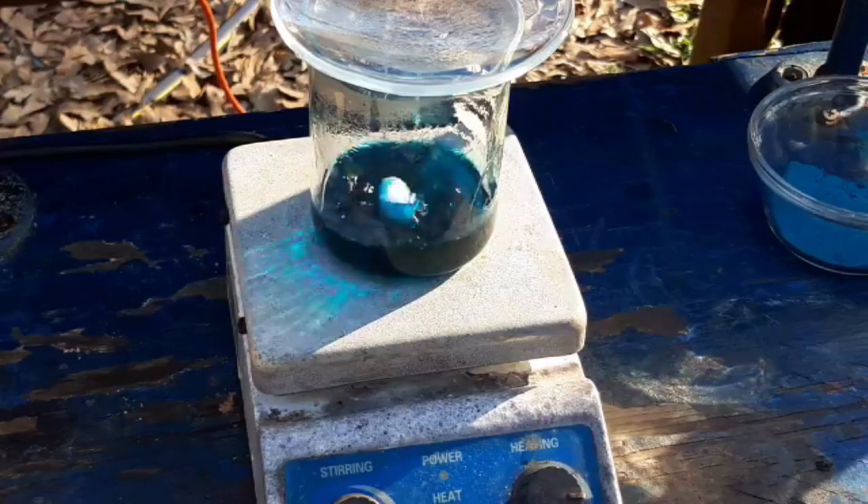I read about the zinc-copper couple. This is before the days of Sci-Hub, where I could just look up how to make this stuff.